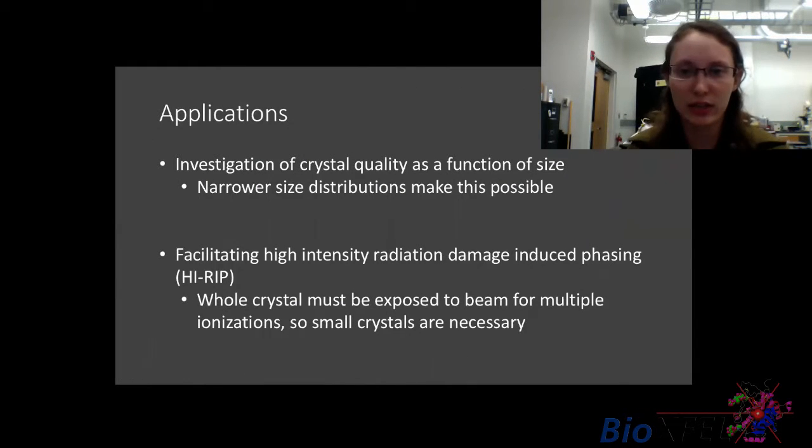So, some applications. One application of this technique is that the narrower size range of crystals this produces would make it easier to see whether crystal quality depends on size, and would enable techniques like high-intensity radiation damage-induced phasing, where the whole crystal really needs to be exposed to the beam in order for the technique to work.